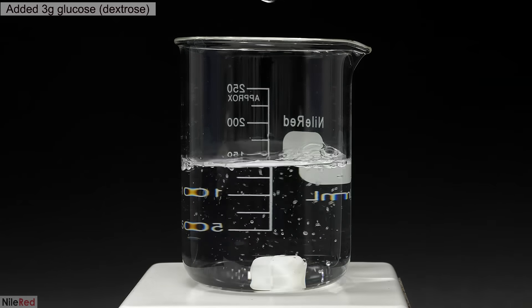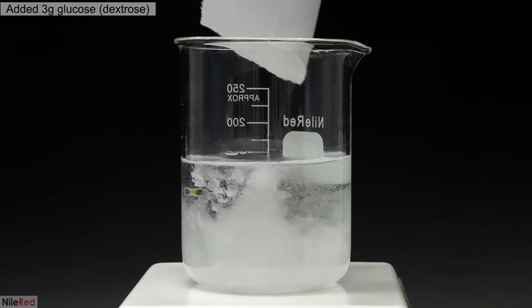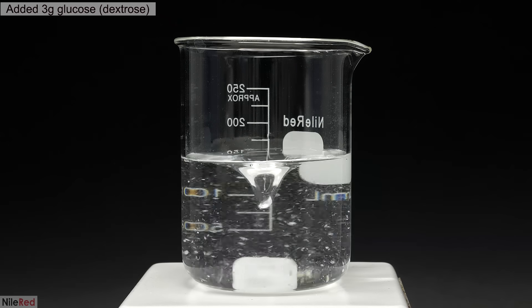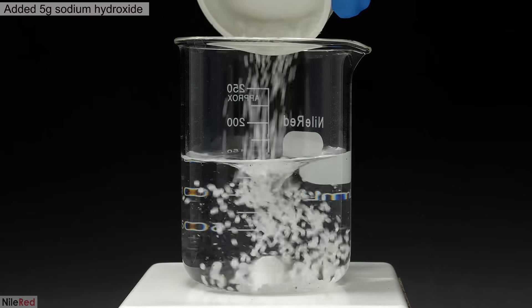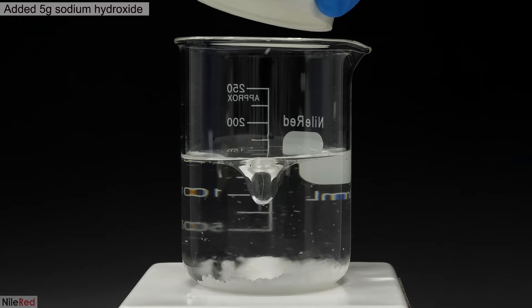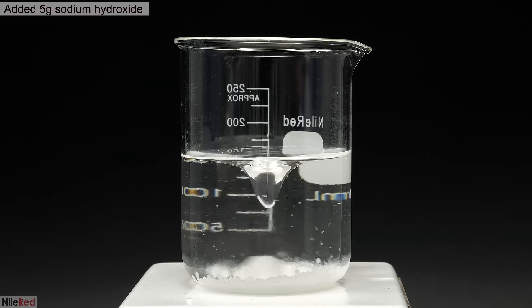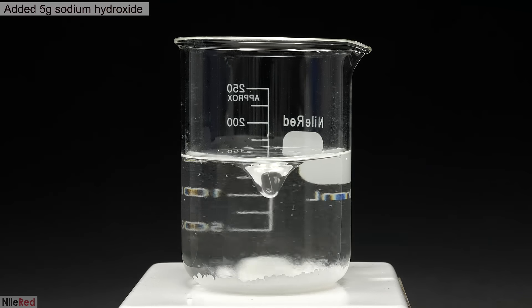To start things off, I added about 150 mils of distilled water followed by 3 grams of the glucose. Then to this solution, I added 5 grams of the sodium hydroxide drain cleaner and I stirred it until it all dissolved. When it was done, I temporarily placed it on the side and moved on to making the indigo carmine solution.